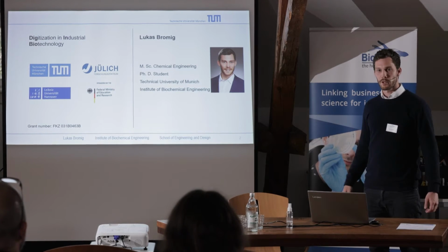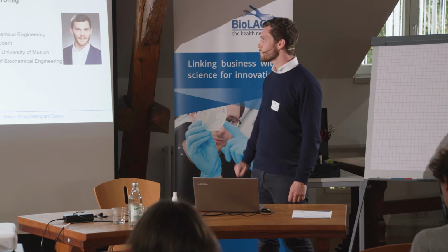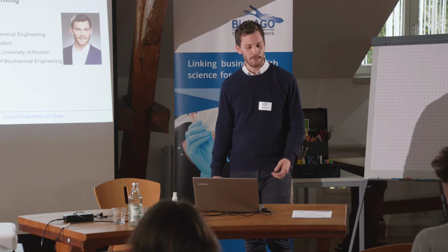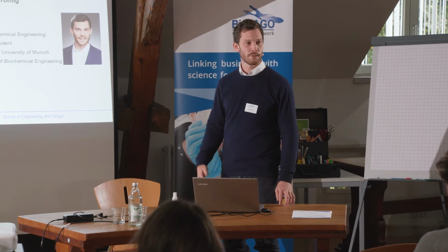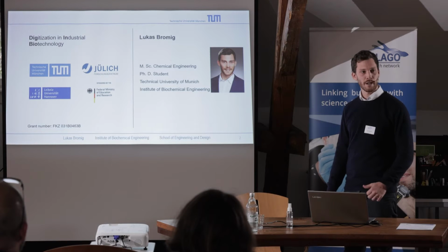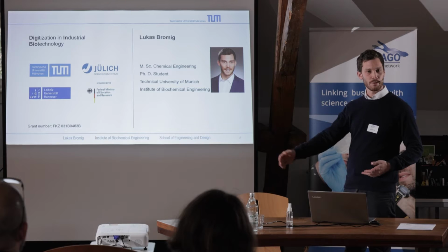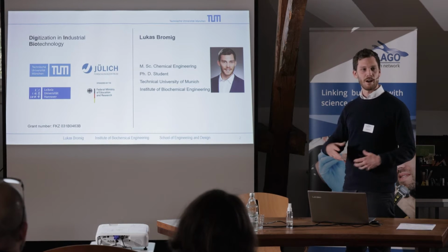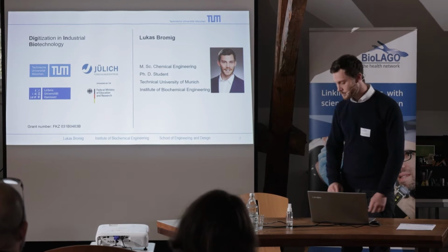And the project that I've been working on since May 2019 was the Digitization in Industrial Biotechnology project, which is a BMBF funded joint national research project with the research center in Jülich and Hanover, which do the phenotypization ahead of us and the downstream processing that comes after us in the entire chain of bioprocess development.